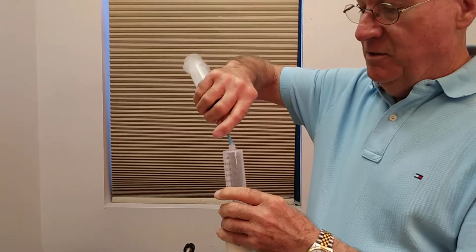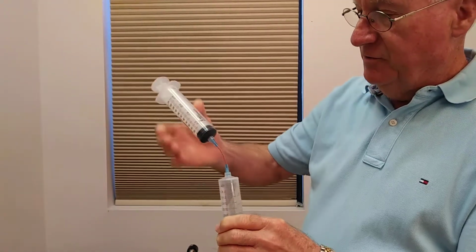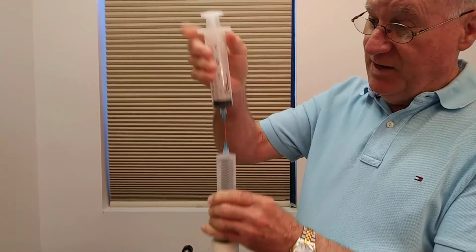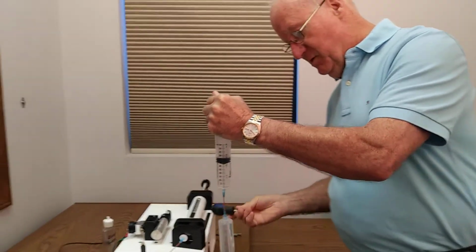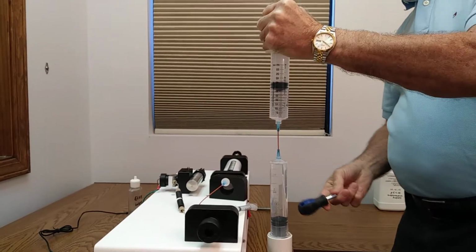Take the degas syringe, which is this one up here. It should be fully compressed before you connect it. It just so happens it is fully compressed. So I'm going to take this and pull up and put some vacuum down here on the liquid.